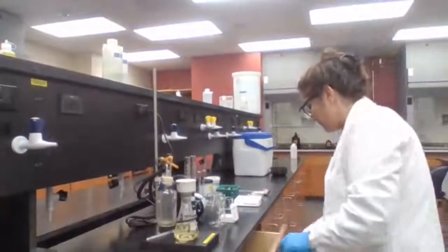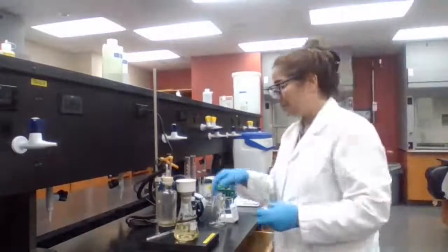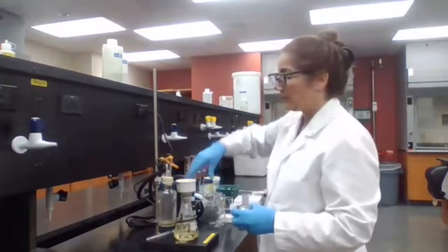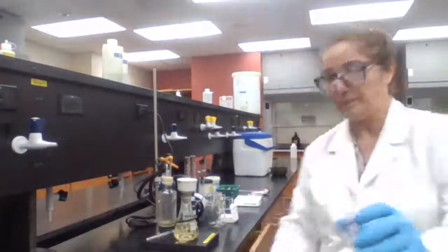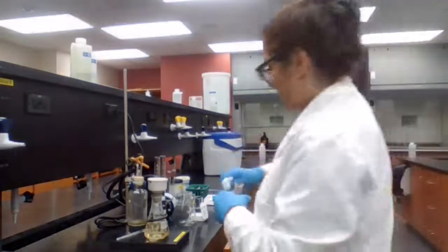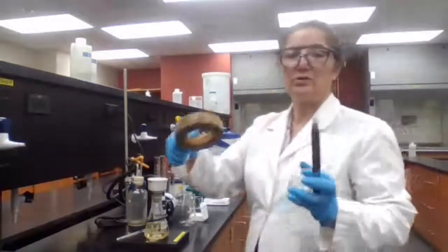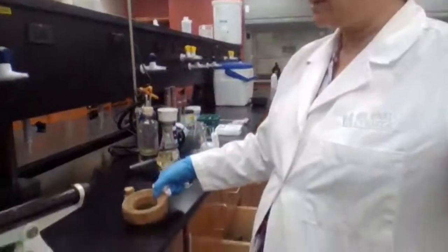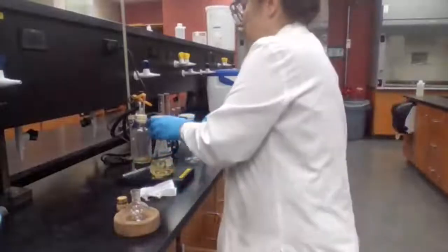Place it in the round bottom flask. In a 100 ml round flask. Okay. Please do not hold the round bottom flask on the table, so I can transfer this.